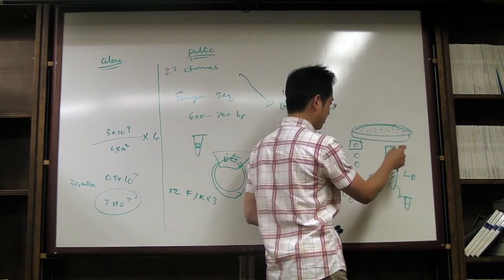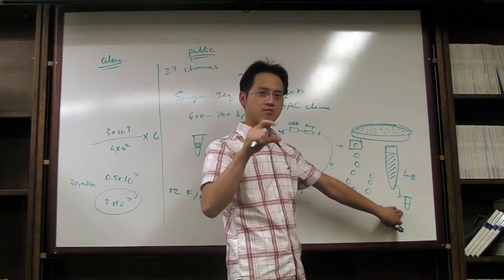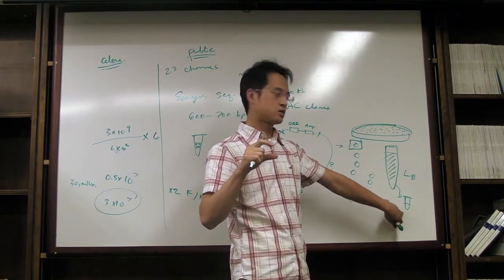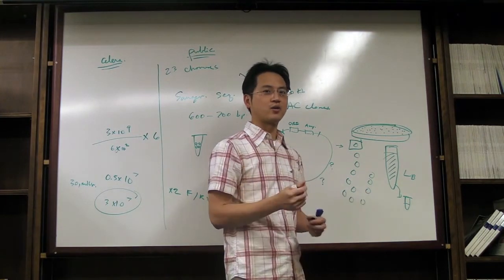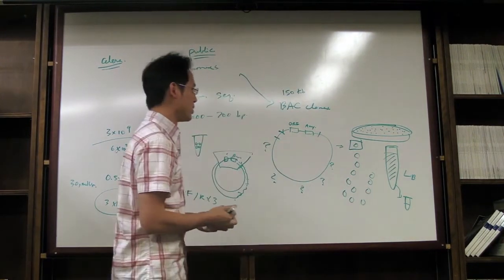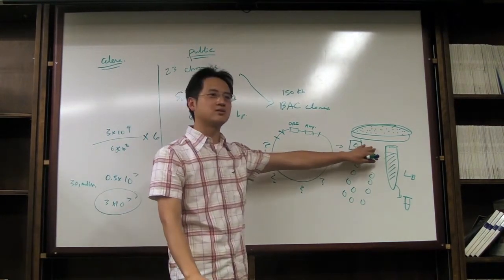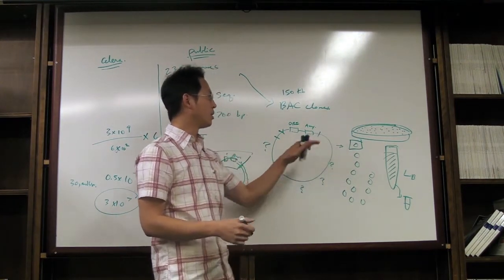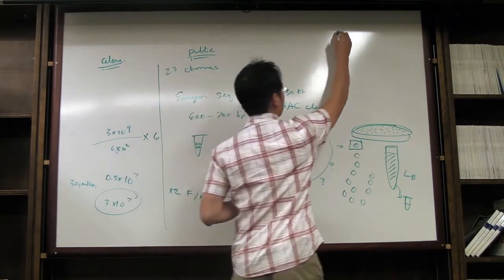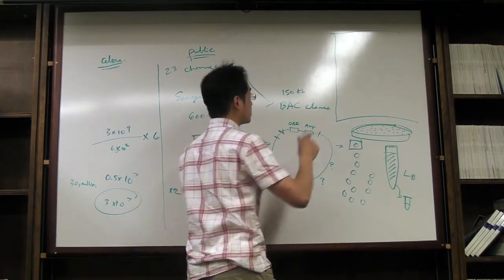30 million test tubes with LB broth. 30 million Eppendorf tubes of mini-extracted DNA, mini-preps of DNA. That's a lot of reactions. So was it done by having thousands and thousands, tens of thousands of workers who just stood there and picked and did mini-preps? No. So one of the key pieces that had to be in place to get this project underway and done was automation.